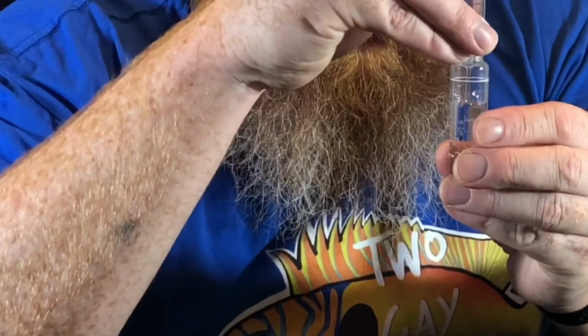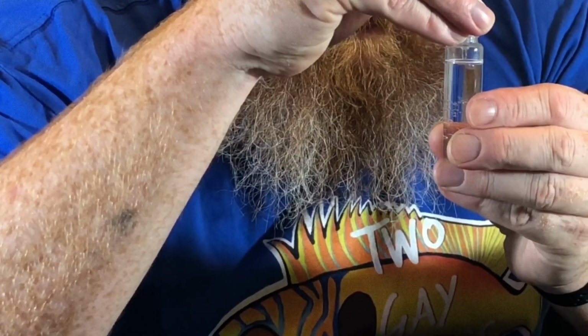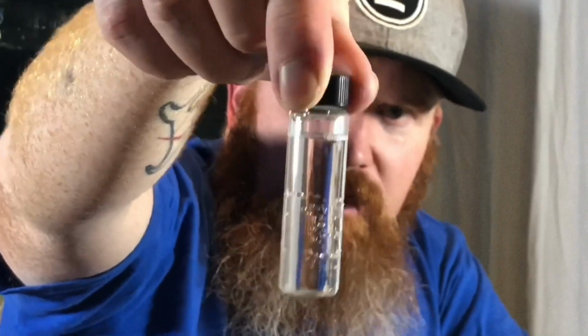So for your phosphate one, obviously use the green one, and you need your phosphate reagent stuff. Turn your Hanna checker on so it goes through cycle one. So you get one of these little vials here, these little tall ones, and you want to fill it up as long as you don't go over the 10 mil mark. As you can see, there's actually a lot of bubbles in there. Okay?